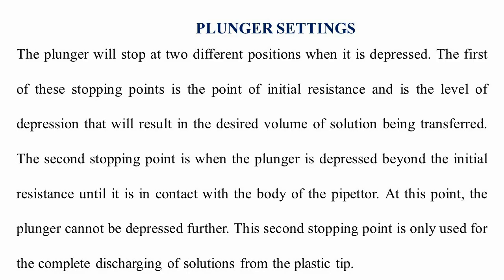The plunger will stop at two different positions when it is depressed. The first of these stopping points is the point of initial resistance and is the level of depression that will result in the desired volume of solution being transferred.